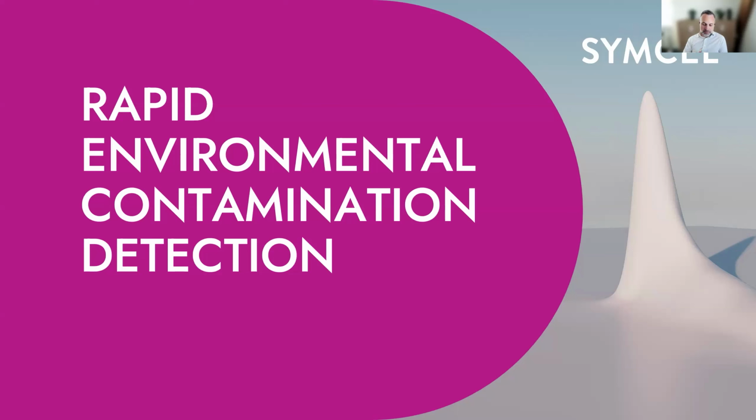So yes, I would like to talk a bit about rapid environmental contamination detection, or sterility testing in a clean environment. This assay really came about because we had a conversation with a big university in the United States, and they had a request for an assay to detect contaminations in their gnotobiotics facilities. So in facilities where you have germ-free mice or other animals, that has to be 100% sterile for microbial contamination.